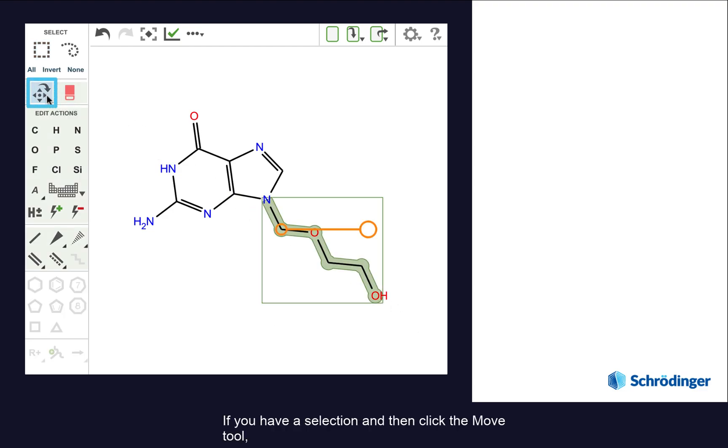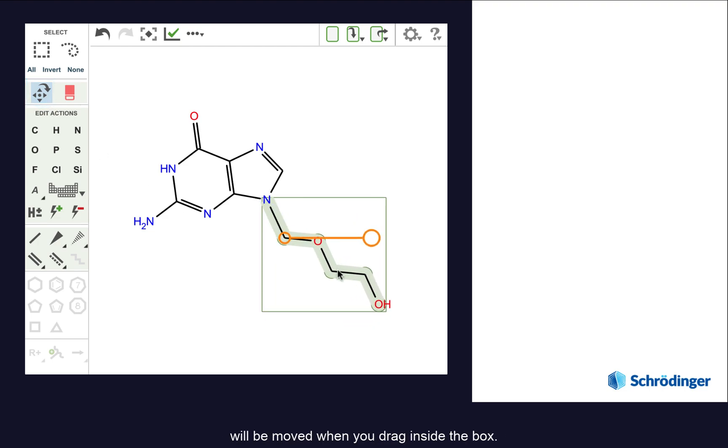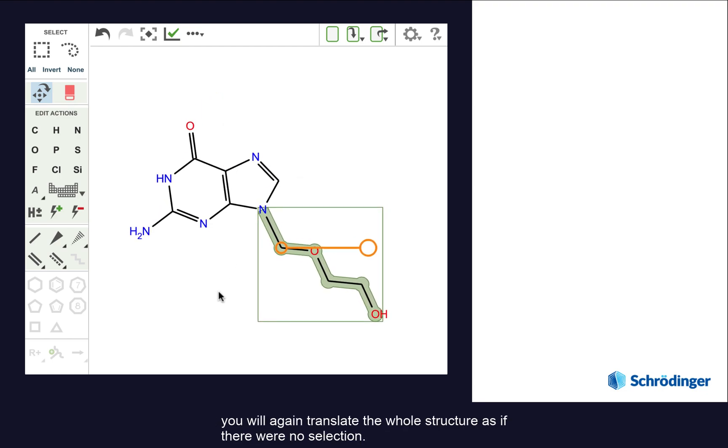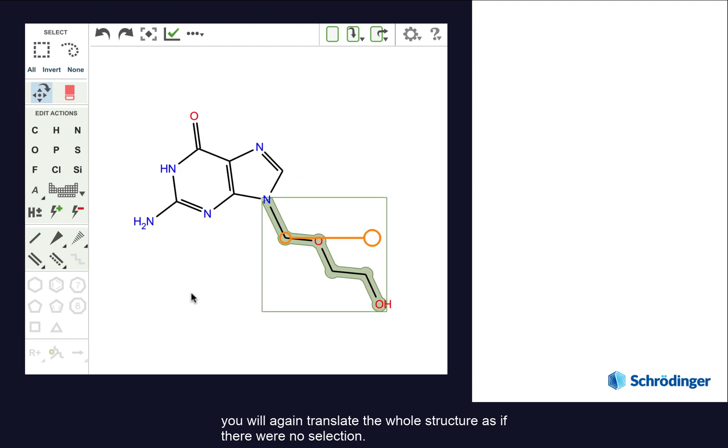If you have a selection and then click the move tool, then only the selected portion of your molecule will be moved when you drag inside the box. If you press and drag outside the selection box, you will again translate the whole structure as if there were no selection.